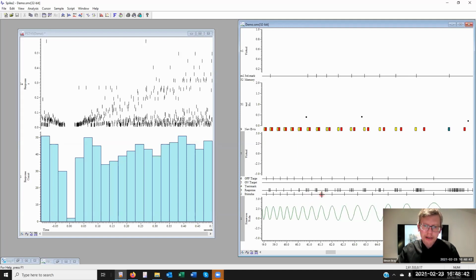But as we move to the next trigger, our sweep length may include data in the previous sweep. And therefore we say, no, we can't process that. So we'll move on to the next trigger. If that trigger is also within the sweep length, it'll also be excluded. So you've got to be a little careful with that.